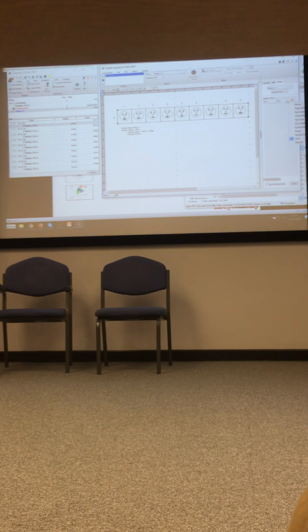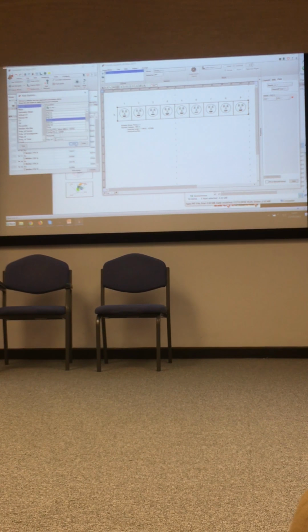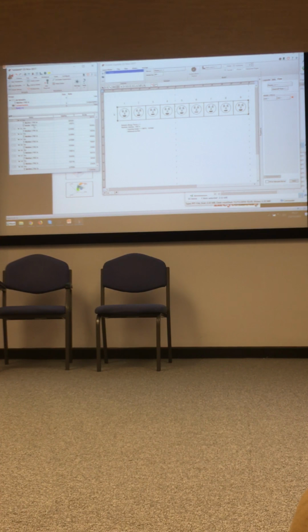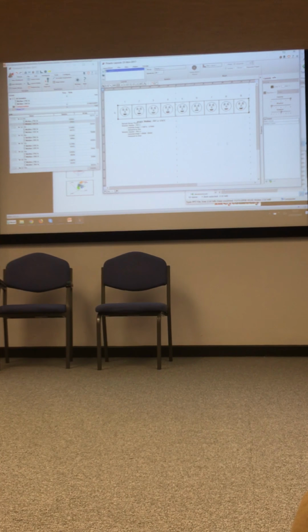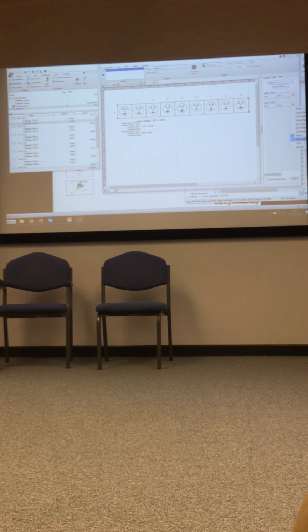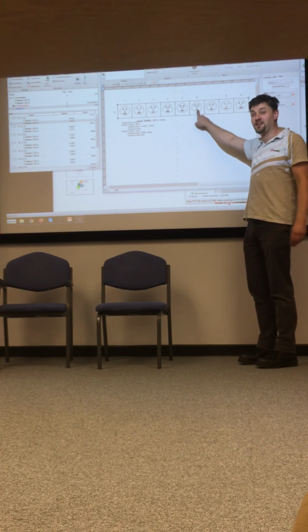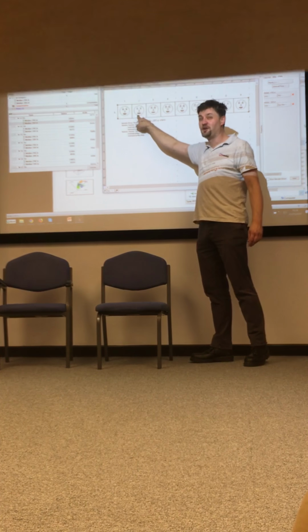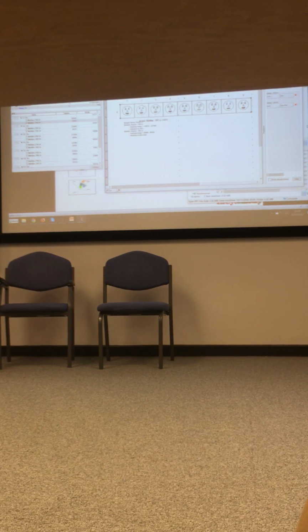If we go for a statistic and add side scatter median, put that up there, with samples, drag that on there. There we go, side scatter median. Has it appeared in Nature or Science yet? No, strangely enough, it hasn't, and I'm not quite certain why. So this one's quite shocked. He's got loads of side scatter, and this one's not particularly impressed with his side scatter. It's a laugh, and I put it up just to lighten the mood a little bit.